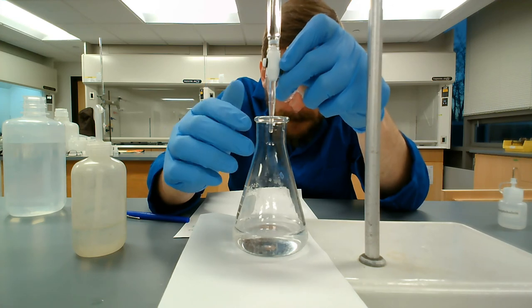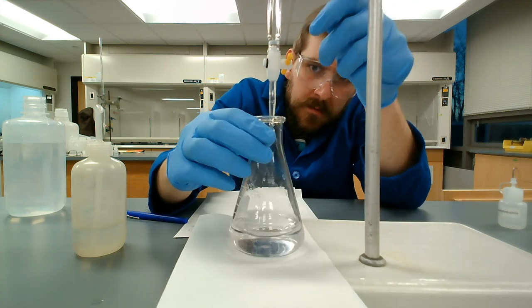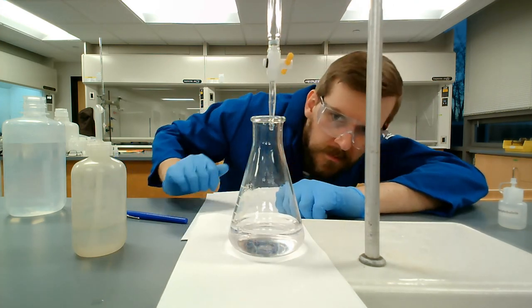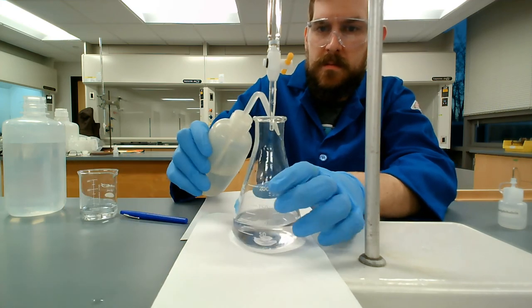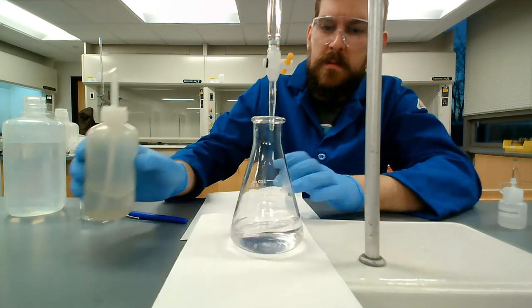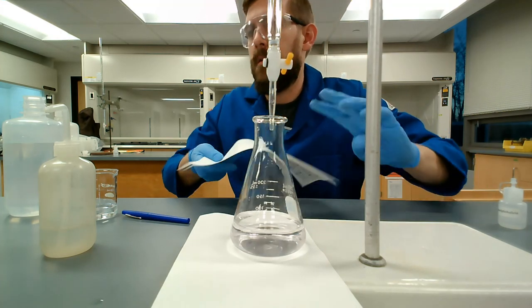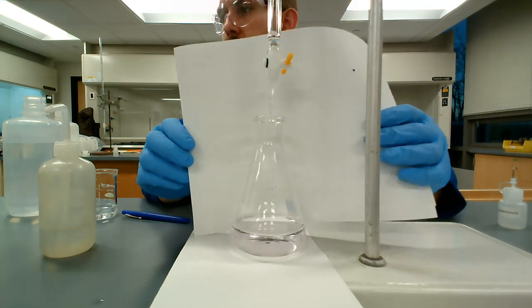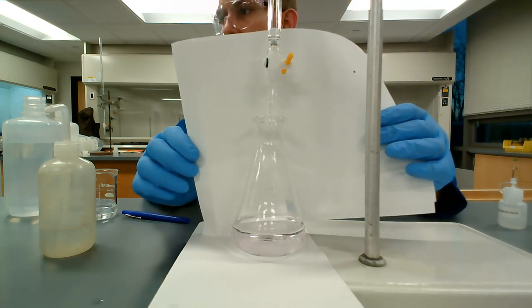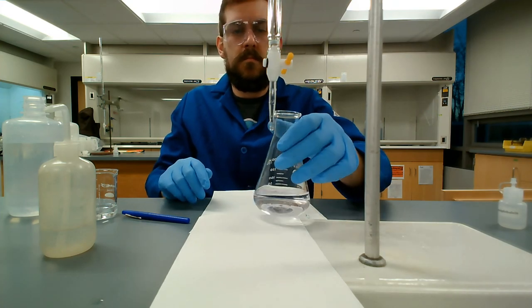So, really close. Just let out part of a drop. I think this is it. So rinse all my sides down because I think I'm at the endpoint of my titration. Make sure all the sodium hydroxide's in the bottom and also make sure none of the oxalic acid splashed up. But this is the end. This is pink. It's absurdly faintly pink, but this is it, right? So I'm going to hold it up to the camera to show you how faintly pink it is.